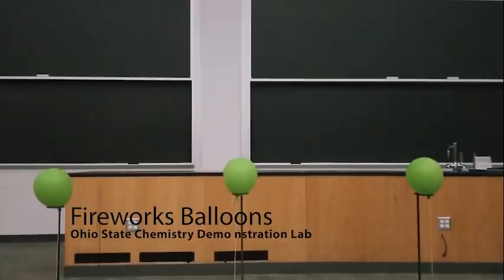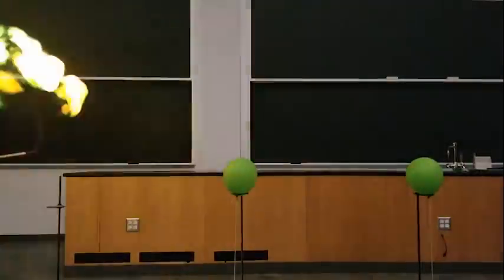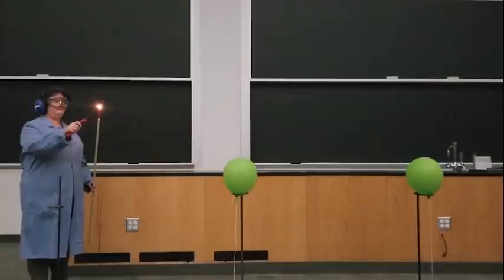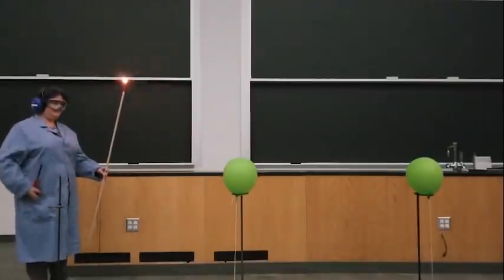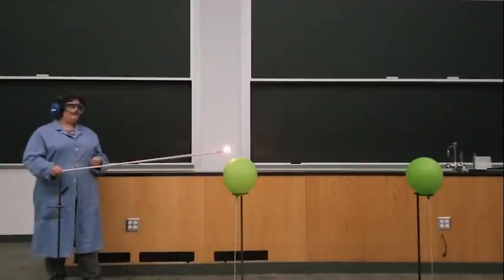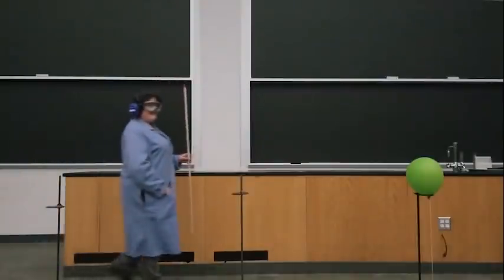In the grand tradition of Go Big or Go Home, we have filled hydrogen balloons with some metal salts. That was boric acid. That was strontium. This last one is my favorite.